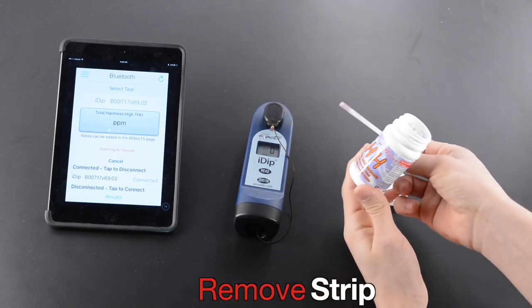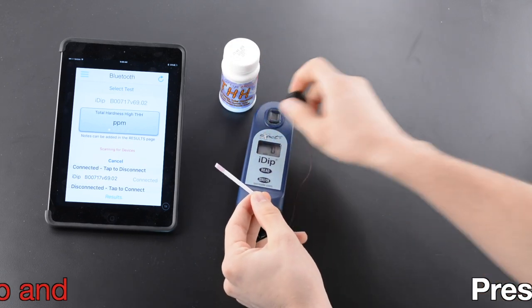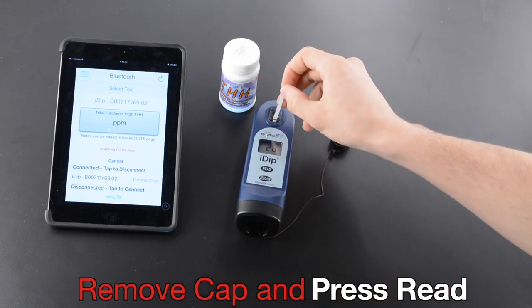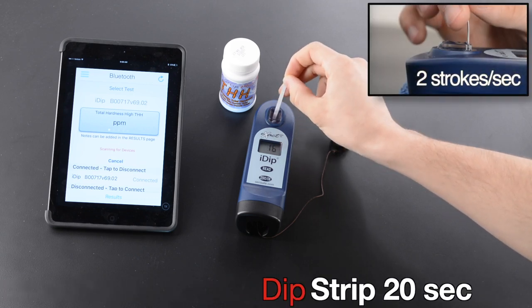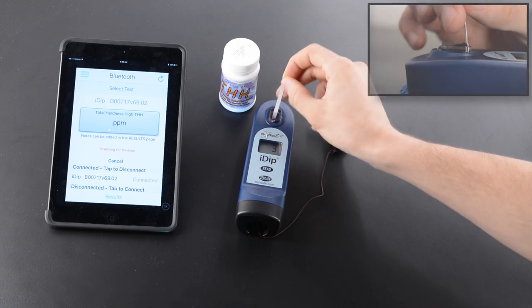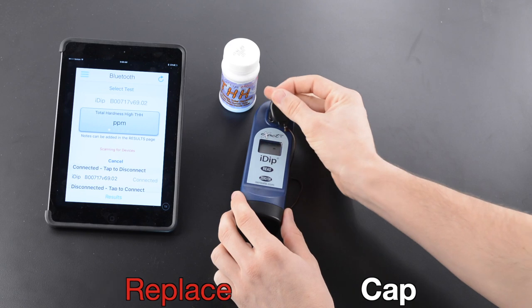Remove strip. Replace lid on bottle. Remove cap and press read. Dip strip 20 seconds. Two strokes per second. Remove strip at one second. Replace cap.